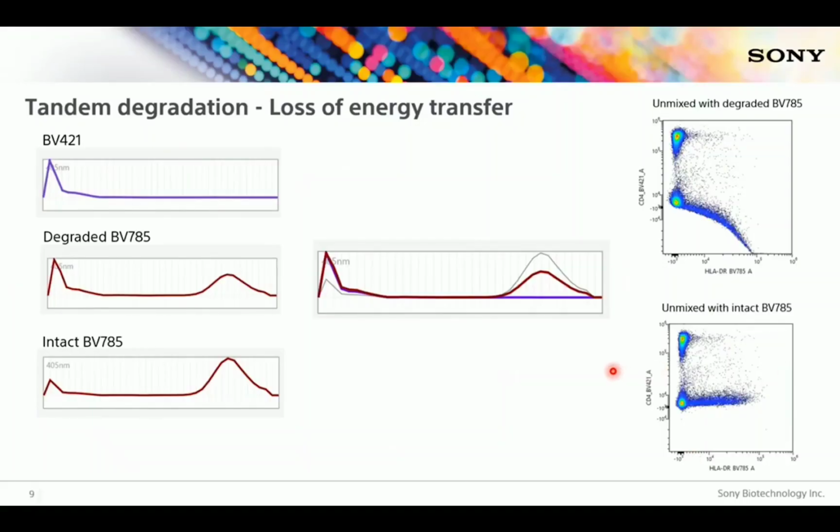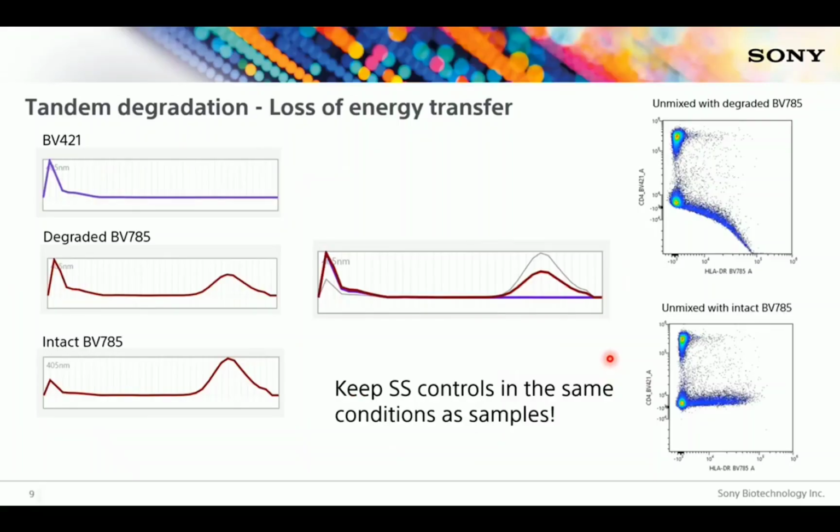So for best practices, always keep single-stain controls under the same conditions as the samples. A good way to accomplish this is preparing the staining, the single-stain controls and the samples at the same time, using the same buffers and temperature conditions.